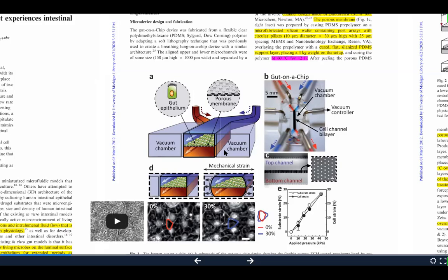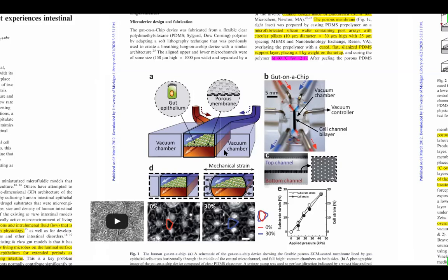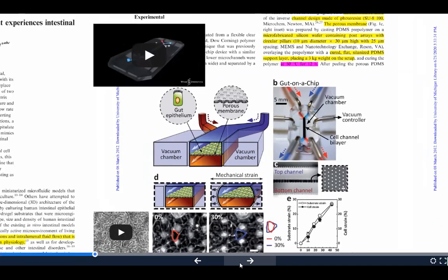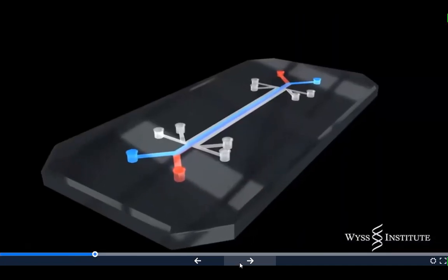I know that many of you would think this device is familiar, because it is the same device that this group devised and invented in the lung on a chip.